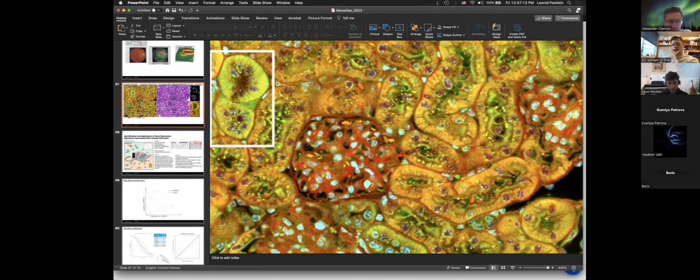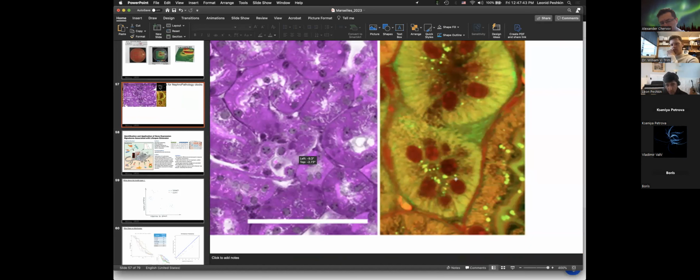Yes. Okay, but we would also want to integrate total protein and total lipid per cell. Cells are pretty hard to segment here, but not impossible. Nuclei seem to me pretty easy to find. And so we would maybe not get perfect cells out, but since this is a nucleus, you could catch some area around this nucleus as a good representation of this cell versus this other cell versus this other cell. So that would also be of interest.